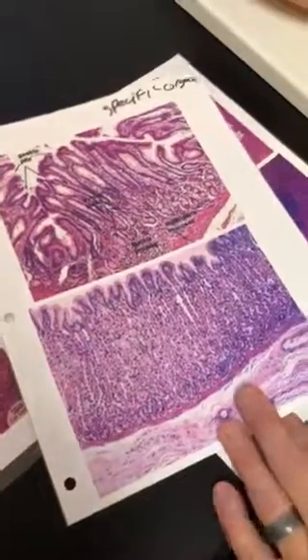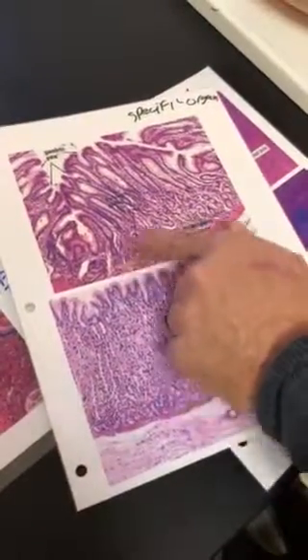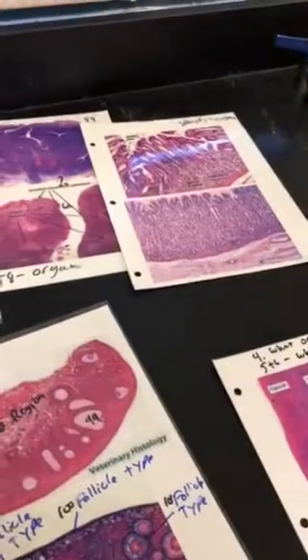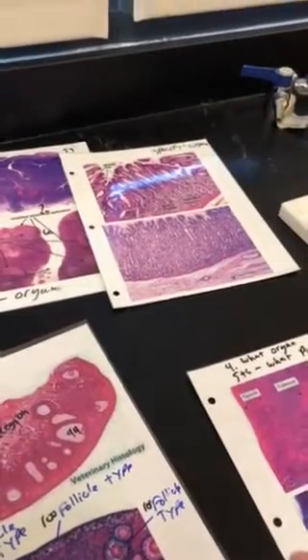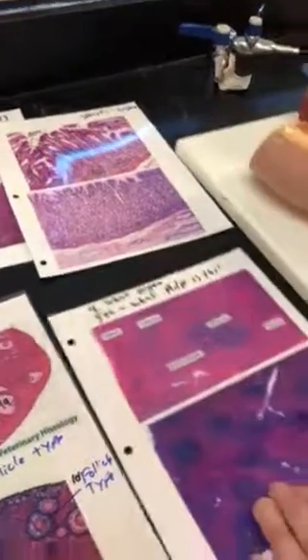This is a duodenum because I have duodenal glands in here. And then, is this the same thing or what? You just have to know. That one is probably the same thing. I am not 100% sure on that one. I'll check. I got you, don't worry. Oh, go ahead, do your thing.